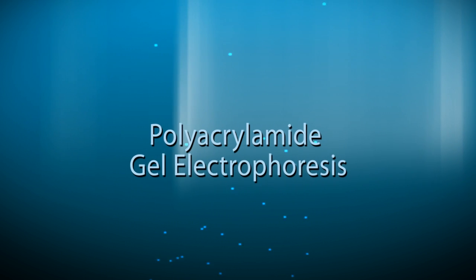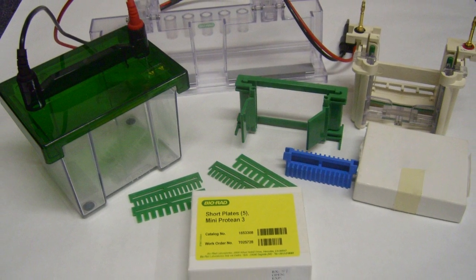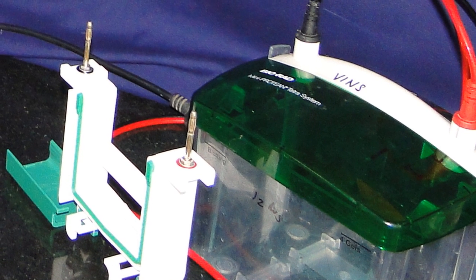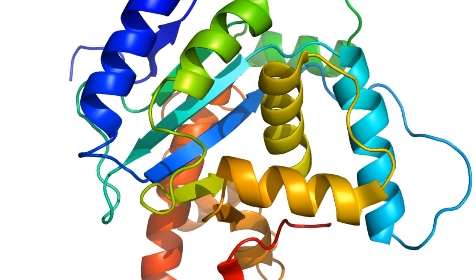Polyacrylamide gel electrophoresis, or PAGE, is the most widely used analytical method to resolve and separate components of a protein mixture based on size. For this, protein molecules of different shapes and sizes need to be denatured.